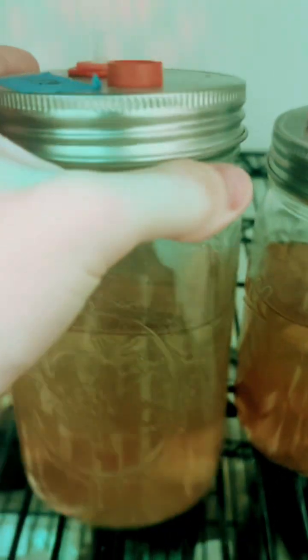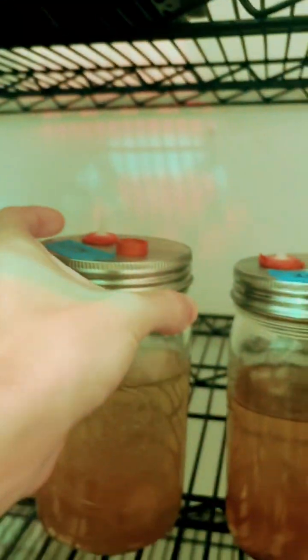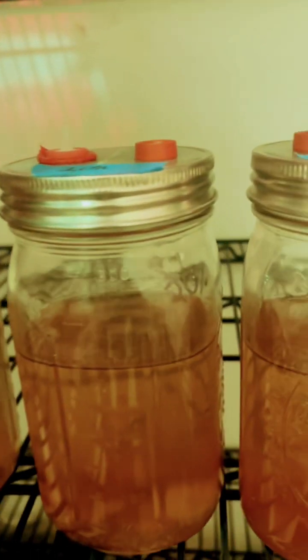But here's 15% right here. 15% starts to get a little bit more cloudy and the orbs start to get a lot smaller from the agar slices.